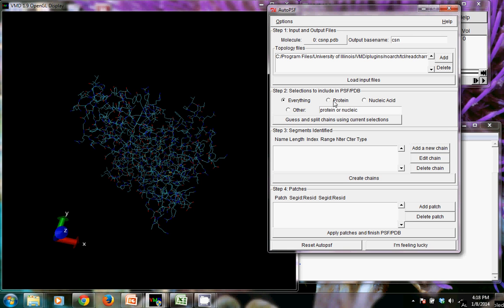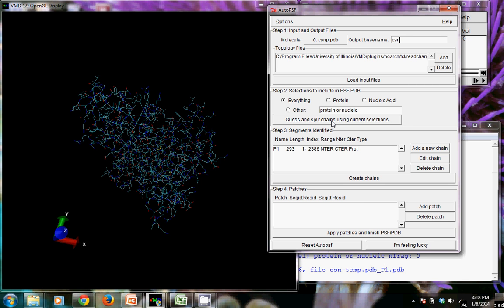Then we want to guess and split chains using current selections. And you may see some things happen if you have the TK console open in the background, but it will make a guess at the chains that you have in your molecule. It's telling us we have 293 amino acids here.